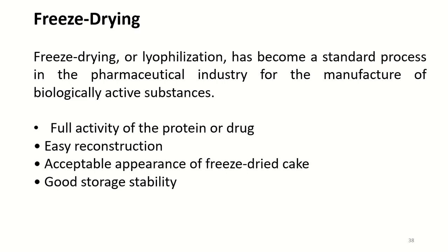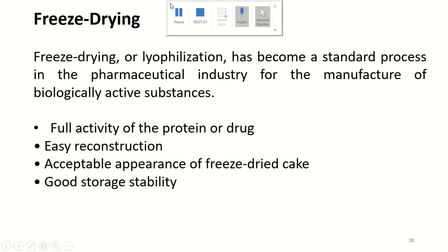However, it is not without limitation due to its high cost in capital and energy, long processing time, and difficulty in selecting manufacturing conditions of time, temperature, vacuum, and component concentration.